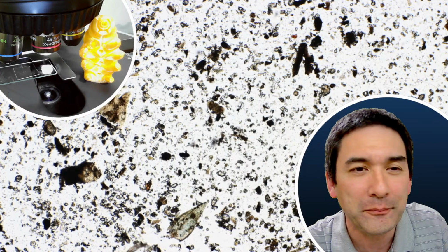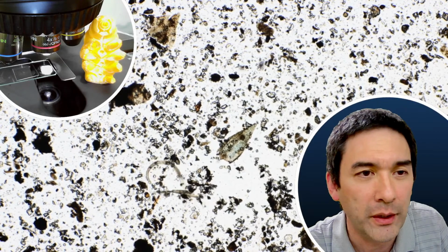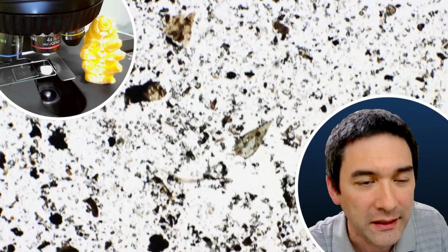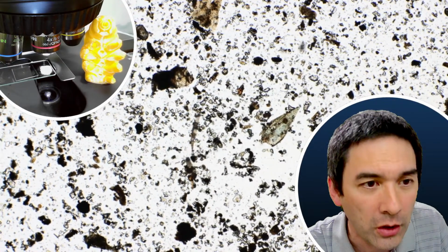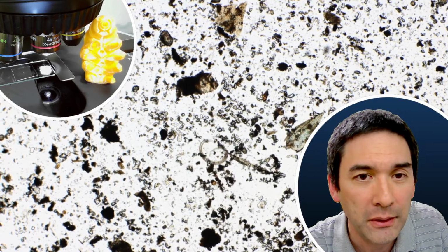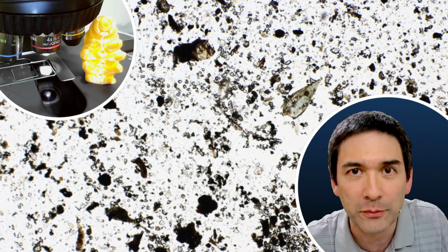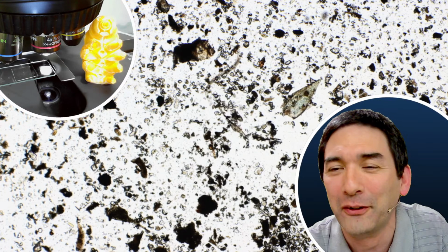Okay. And what you see here in the background is already a sample where I'm hopeful to be able to find a few tardigrades. I mean, there are tardigrades present. There are not many of them, I have to tell you. But I've seen already 5, 6, 7 of them today in the afternoon. But the one that I wanted to actually prepare simply walked off on me.